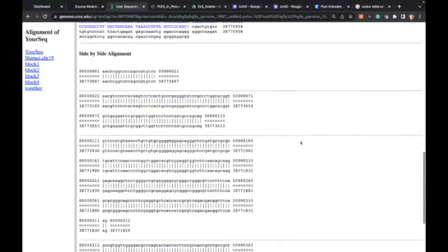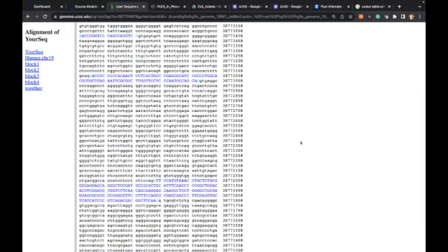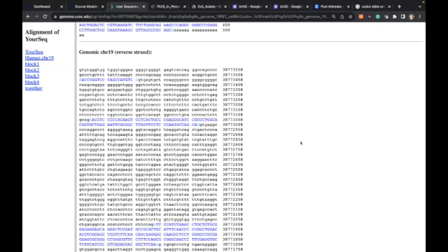Here is the alignment detail, 100% alignment. So the blue ones stand for where it aligns. So black ones are the intronic regions. So it's basically about the same as Splign that you guys use. So I told you that Splign is the tool offered by NCBI, and BLAT is the one from UCSC. And somebody may think, I prefer the Splign, but somebody may prefer using this.